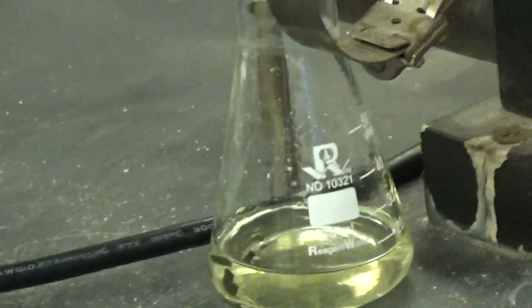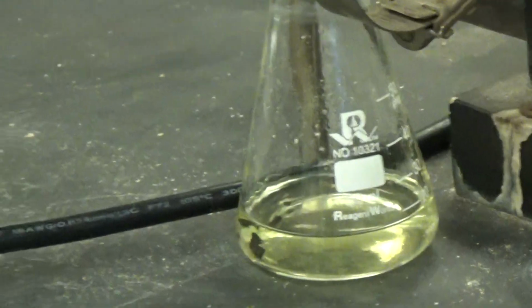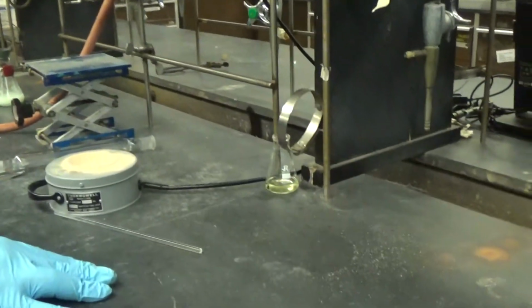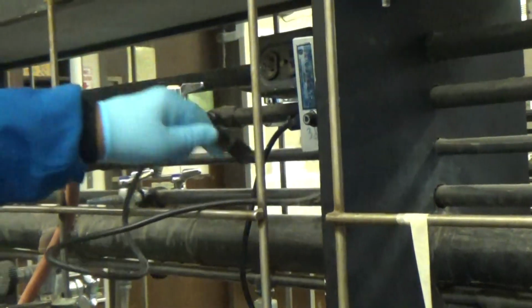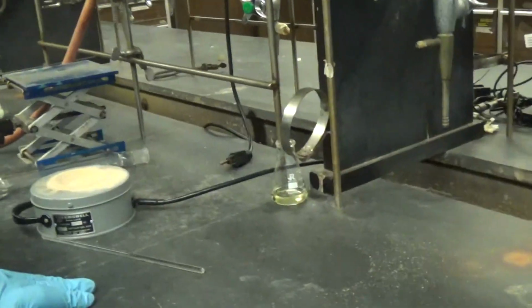So I need to let that cool down to room temperature and it might crystallize? You know that crystallization is a slow and selective process, and you need to be patient. And as usual, first thing we do, turn that off. Turn off the heat. Unplug it, both. And you wait.